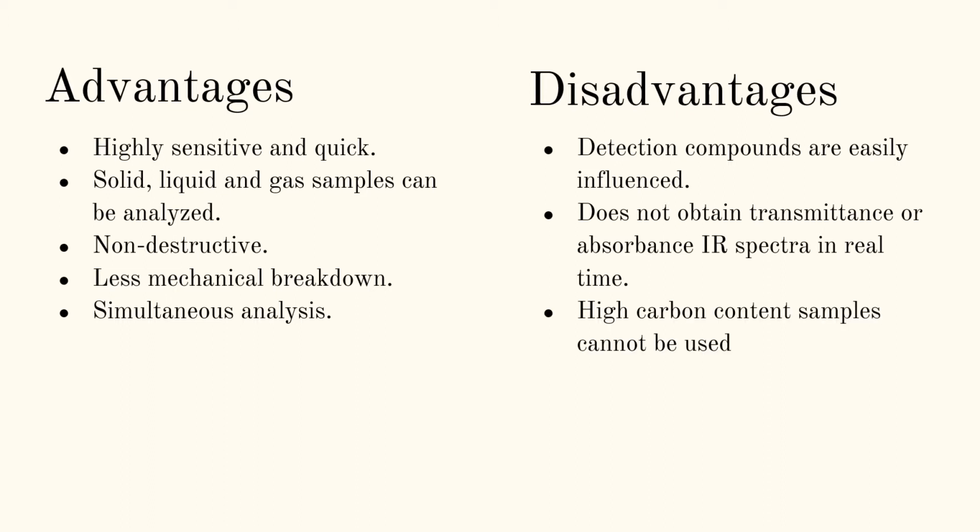Materials with large quantities of carbon, such as carbon black or carbon fiber, are difficult to obtain a usable spectral scan from FTIR because carbon strongly absorbs infrared light in a broad range of frequencies. This results in an FTIR spectrum without the minute details necessary to identify the unknown materials.